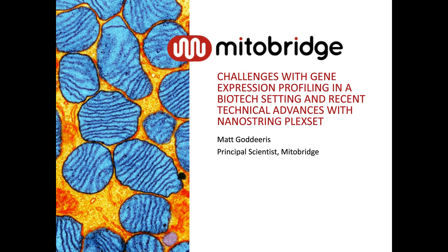Thanks, Anisha. 5 years ago, if you would have asked me what the biggest challenges were with qPCR, I probably would say reproducibility. This has always been something that has bothered me about the technology, and it basically required an increase in the number of technical replicates in any given experiment in order to feel a little bit more confident that the data you're getting are representative of the biology.